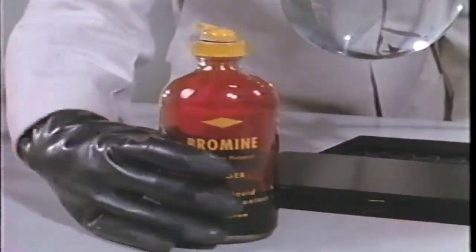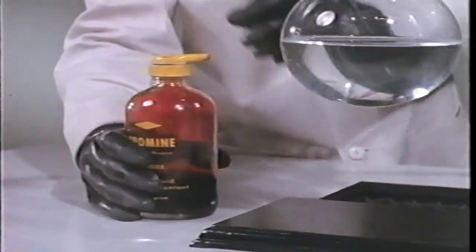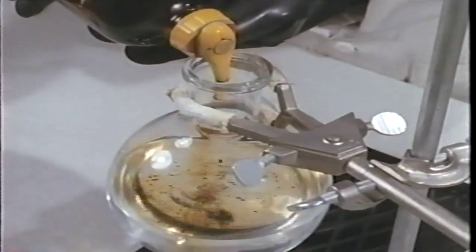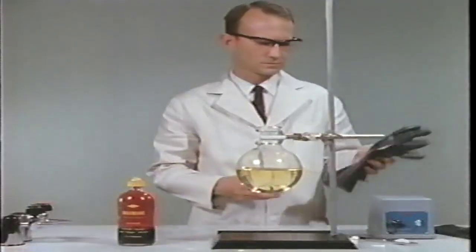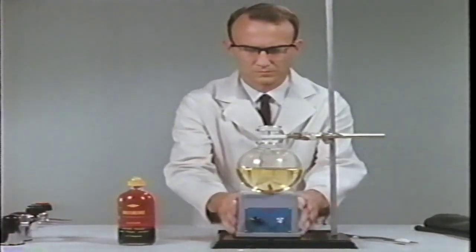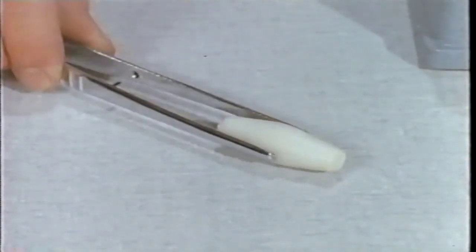But what about the solubility of bromine itself? When bromine is added to water, it settles to the bottom, indicating that it is more dense than water. Now we'll mix the bromine and water with the help of a magnetic stirrer and a plastic-coated magnetic stirring bar.